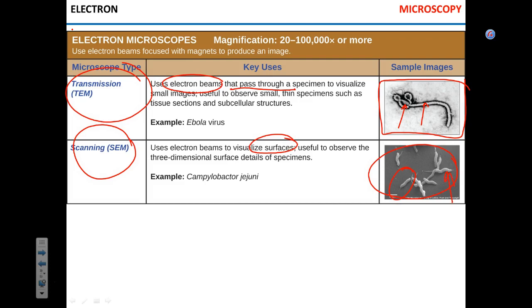Using cryo-electron microscopy, you can look at the individual virus and see individual subunits of the virus capsid, the structure that surrounds it. I think now with some high resolution, you can see individual amino acid residues in the proteins. It is unbelievably cool, unbelievably powerful, and what's important, you can use a pretty dirty sample. You don't have to have a high purity sample.